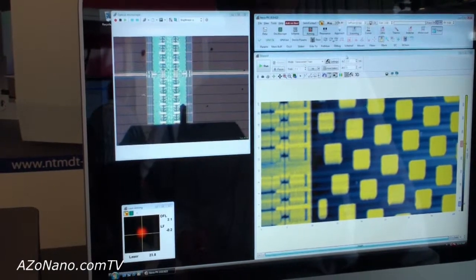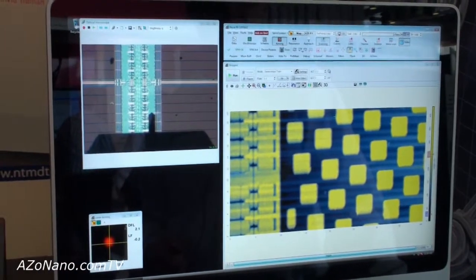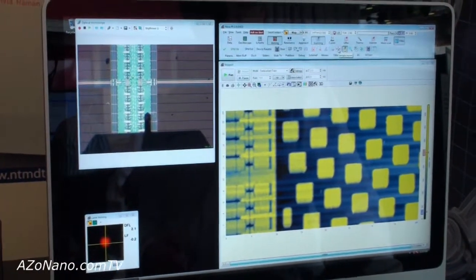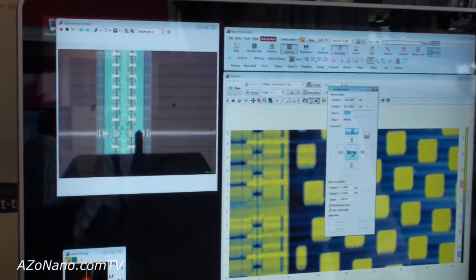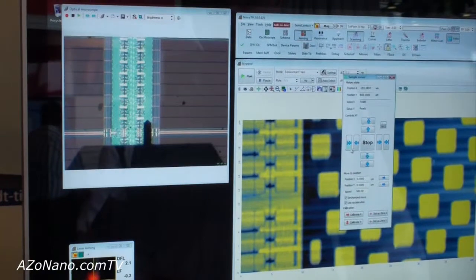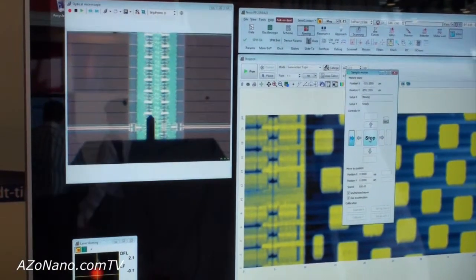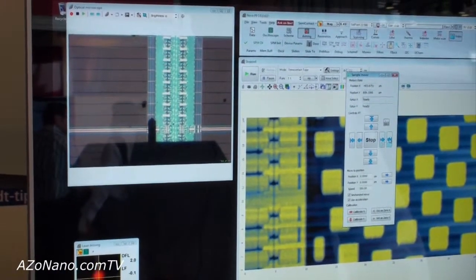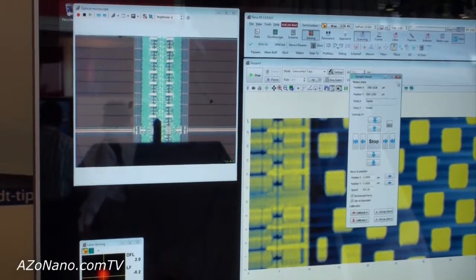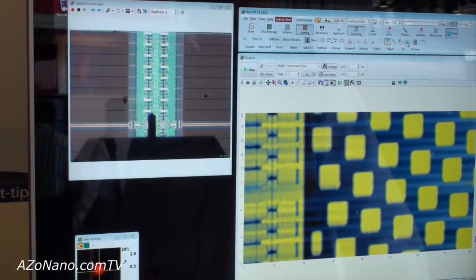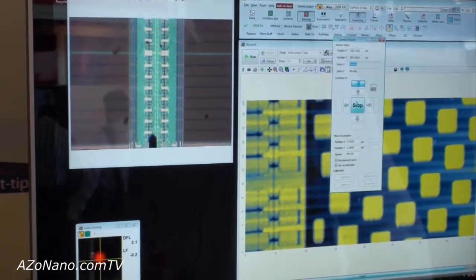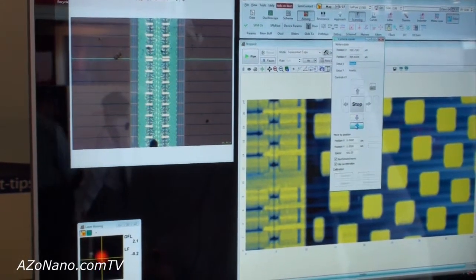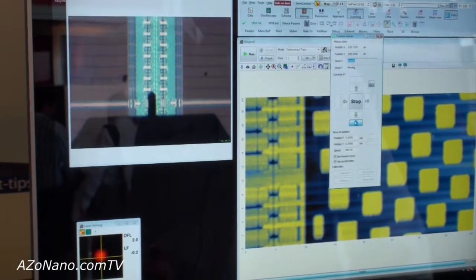From the software we can move the sample in XY, easy like this. You can also move the camera in XY in order to find the proper place on the sample surface.